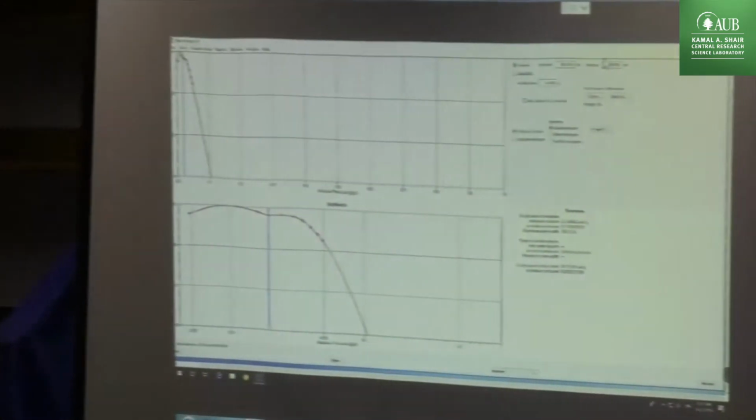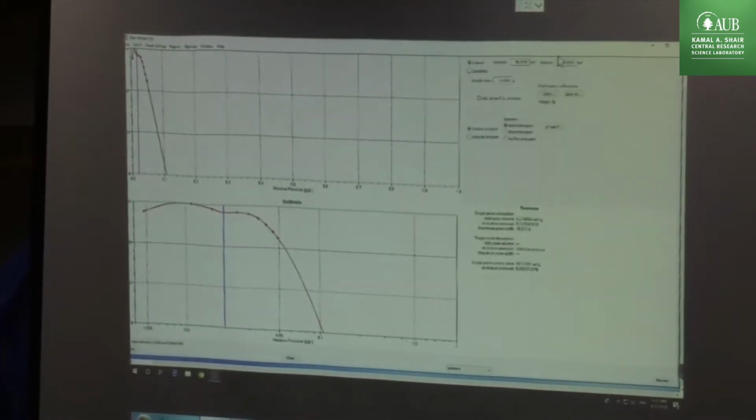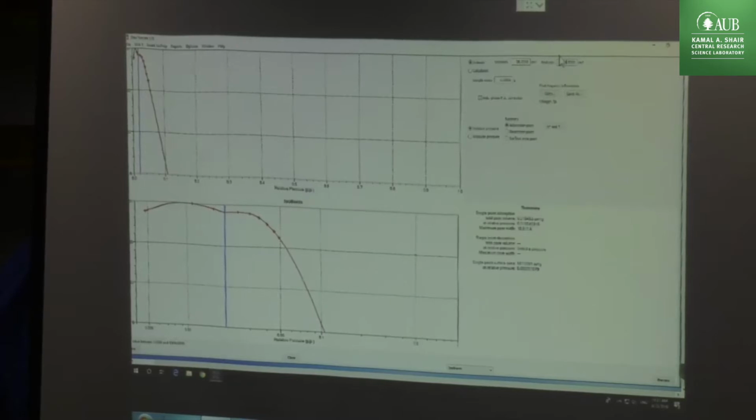Instead of calculating the free space, you enter the free space, warm and at 77K. The system has to know the free space of the empty sample tube at room temperature, and the volume at 77K will go up. This is very important for the instrument. Every time it measures the volume adsorbed, it has to know the empty volume of the tube. Remember, as I told you yesterday, we inject this amount of gas, and after equilibrium, this is what is left. So we measure the difference between what we dosed and what is left. We don't have anything inside the system.